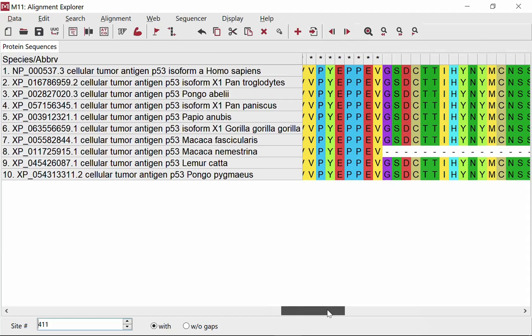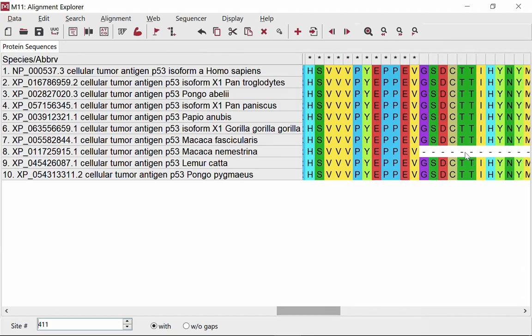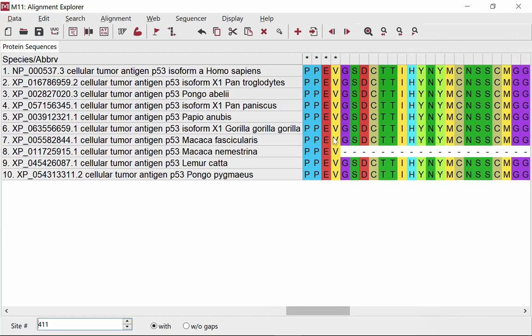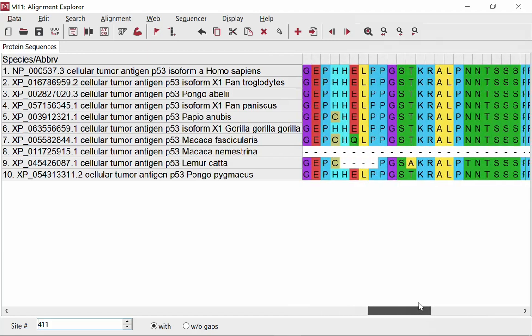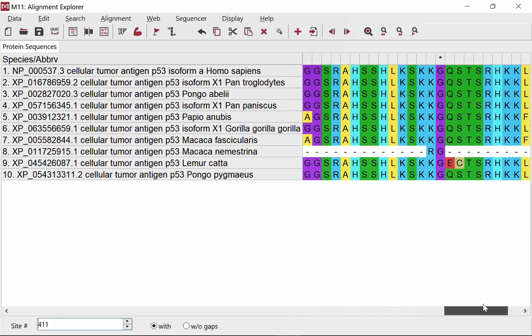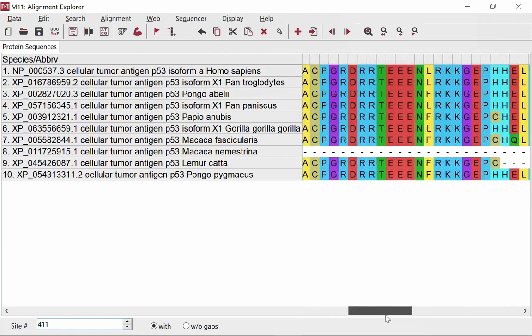These are the best alignments, the ones with the highest scores, of course. It looks for common sequences or differences where there is insertion, deletion, and so on. Here you can see a deletion in Macaca nemestrina, a very long deletion, actually multiple deletions. There is another long deletion in this part right here, and so on.